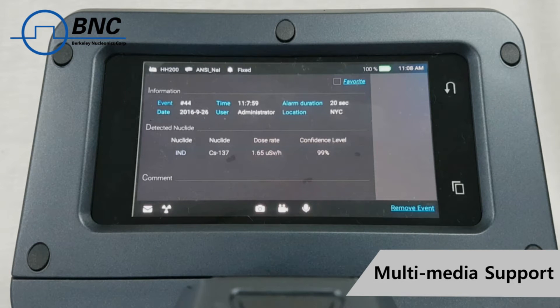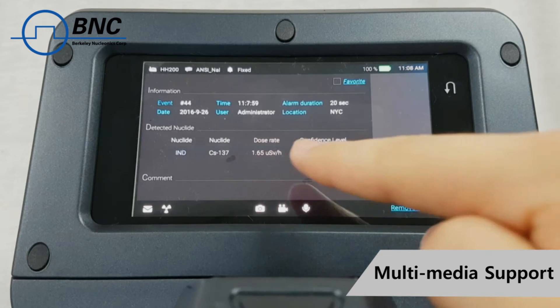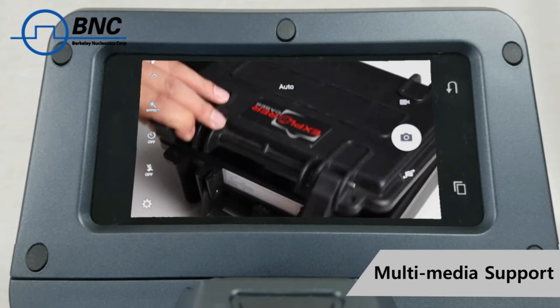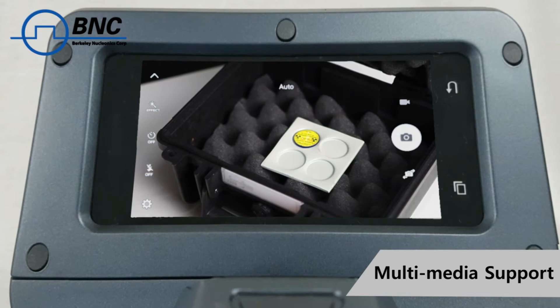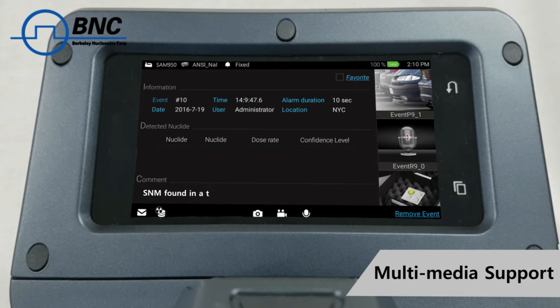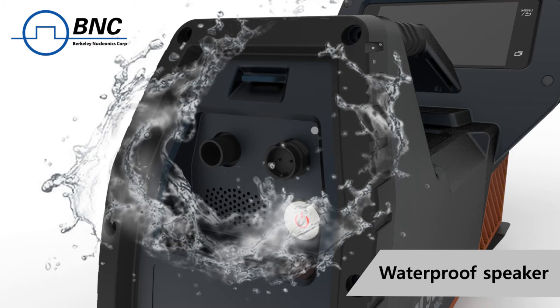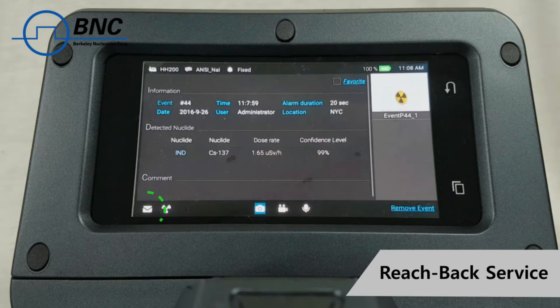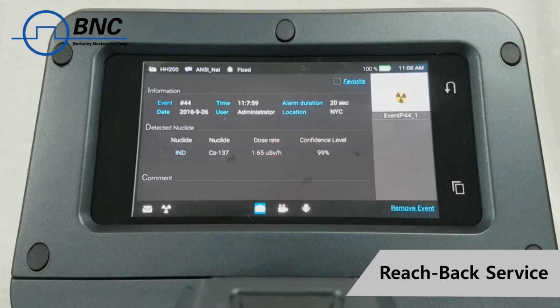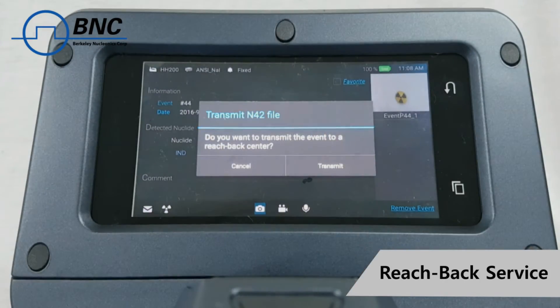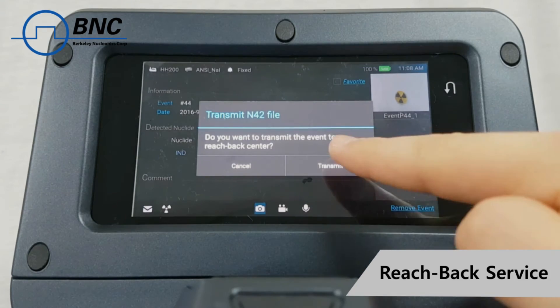The SAM 950 allows users to store text and audio messages, pictures and video, and tie these media files to alarm events. A waterproof speaker allows review of audio or video files as well. The SAM 950 provides a one-click reach-back solution that transfers data to the RAD Responder network, or to another reach-back center.